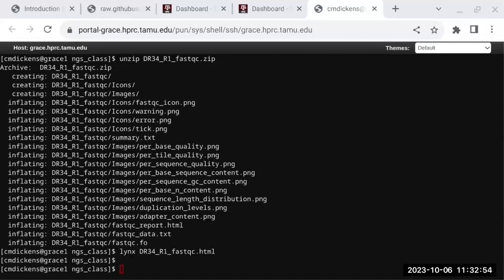Someone in our lab ran DNA sequencing. They did their own library prep, loaded the machine, and ran it. And then when they saw this, they said, well, there's something wrong with your sequencer. Look what happened to my data. Halfway through, the sequencer failed or something. This ain't right.